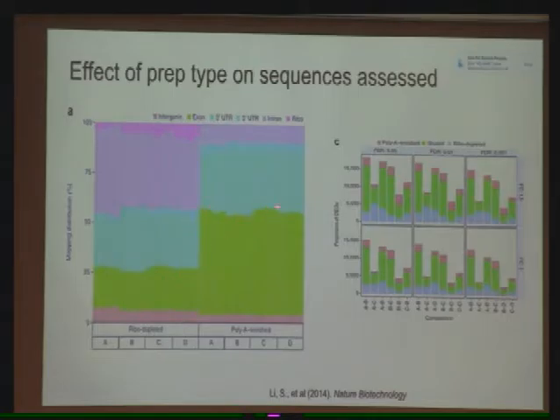So you're getting almost 50% of your data going to exons in poly-A. So that means almost 50% of your sequence data that aligned is to exons. But with the ribodepleted, you're only getting less than 25%. And the intron content is much higher here because you're getting some transcripts that are not fully processed, so they include their introns.